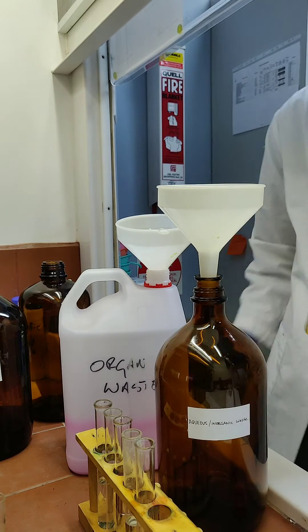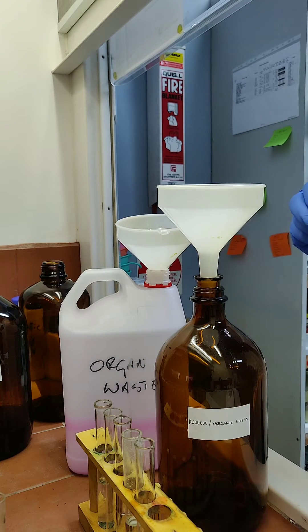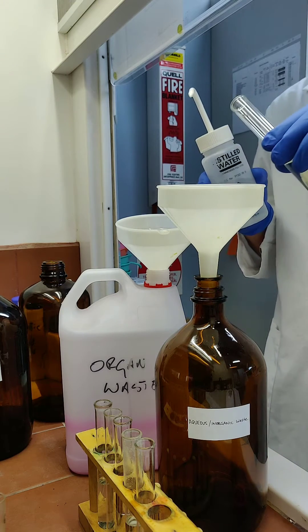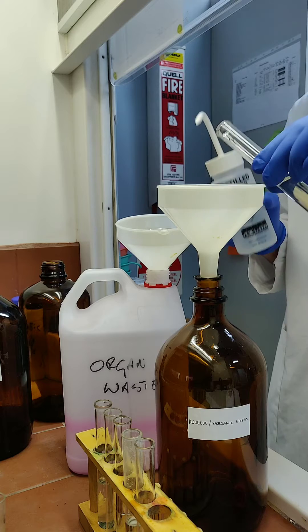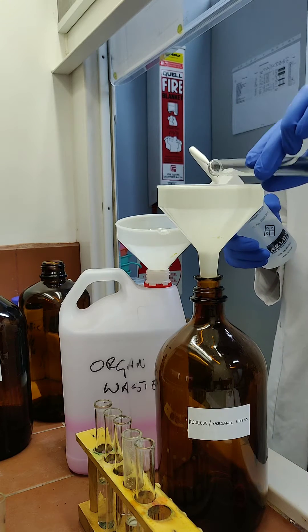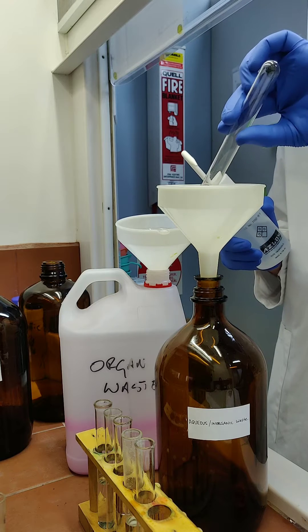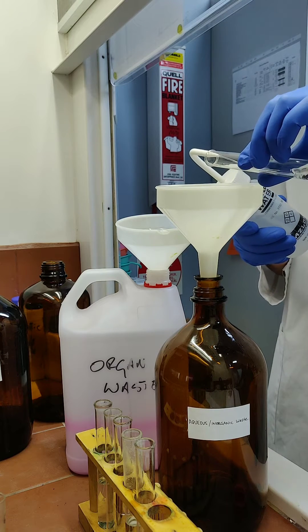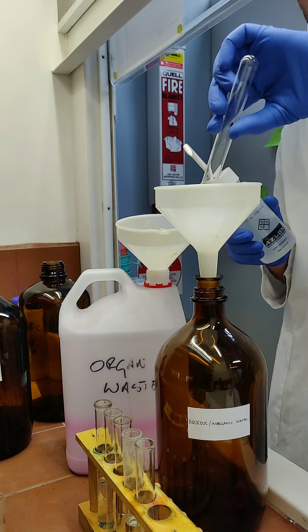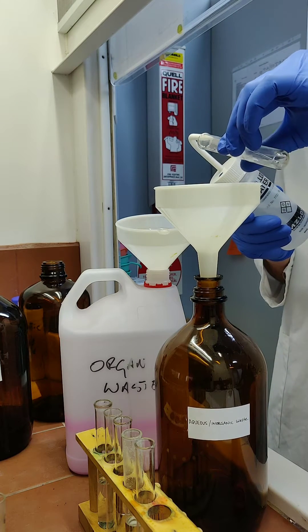Let's discard the iodine crystals in water. Ensure that there's a funnel in the top of the jar, discard the contents, and ensure you rinse out the tube. Make sure that all the waste goes into the discard jar.